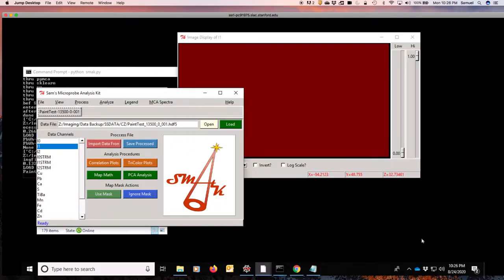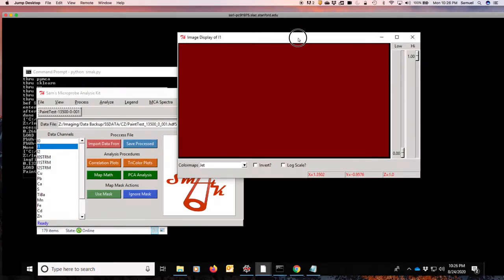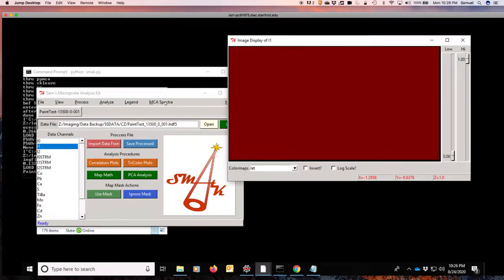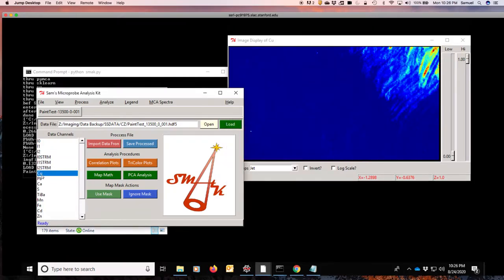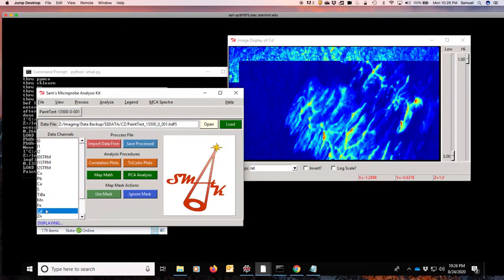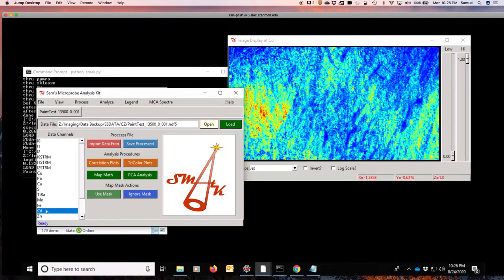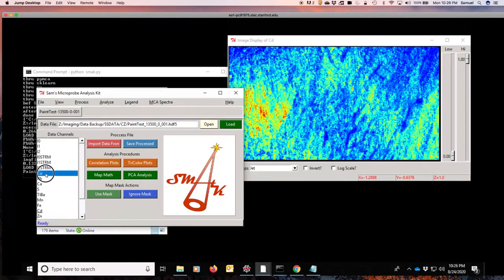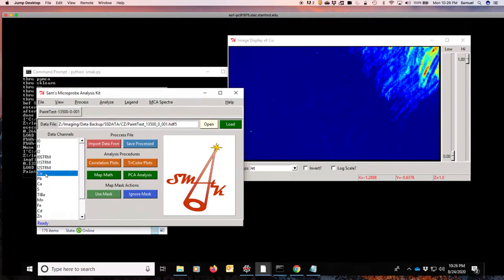Here is our paint swatch and we can look and we see that there are some copper paints, there are some titanium-based pigments and some cadmium-based pigments as well. Now we want to correlate our elemental signals to our color signals of course.